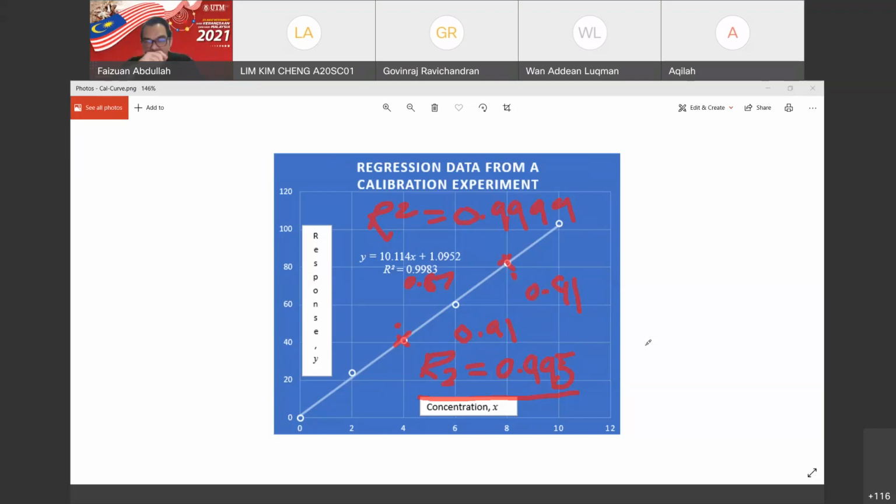But there are some exclusions. For example, in biological experiments and so on, they have other values that are acceptable, right? But the most common one is 0.995, right? The perfect one is 0.9999.